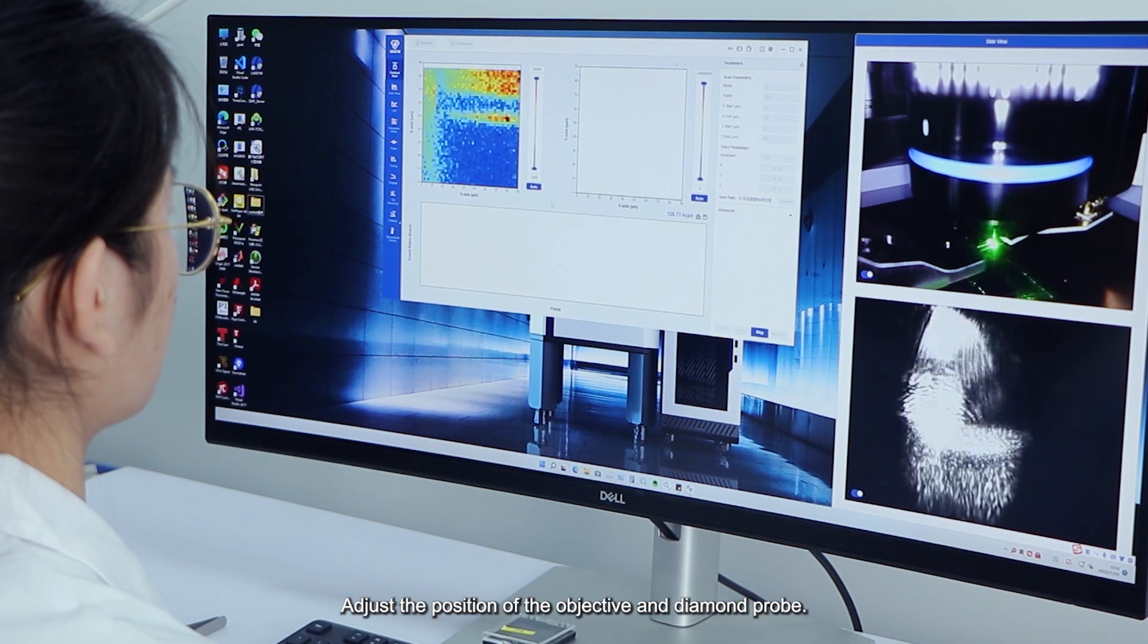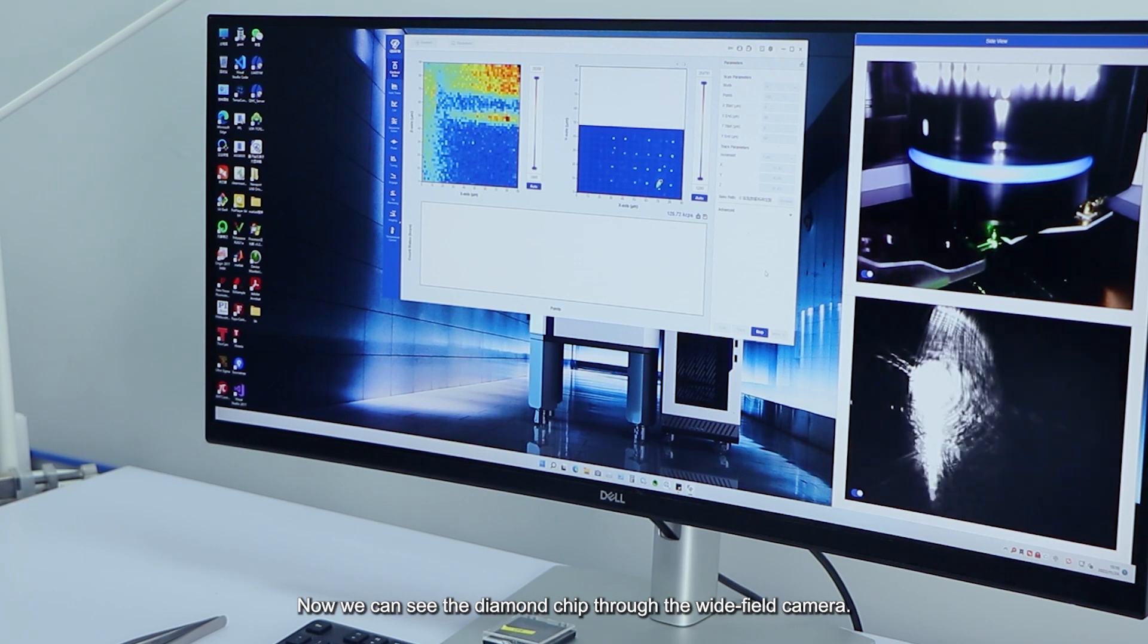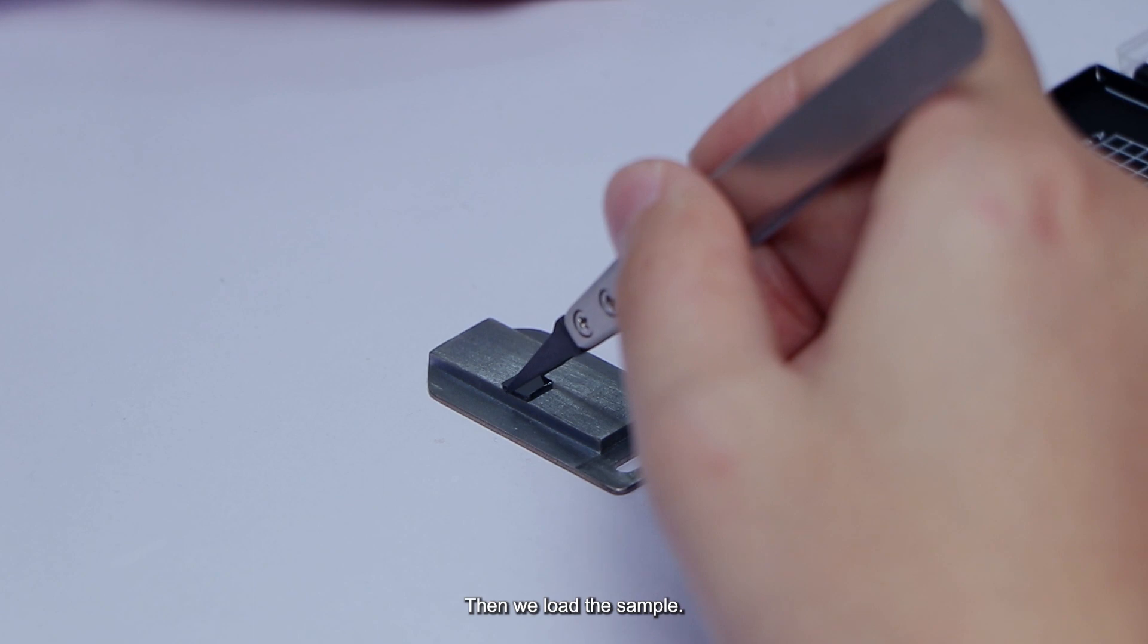Adjust the position of the objective and diamond probe. Now, we can see the diamond chip through the wide-field camera. Then we load the sample.